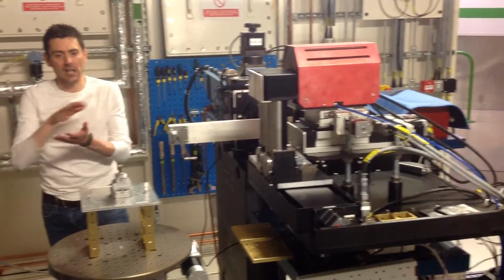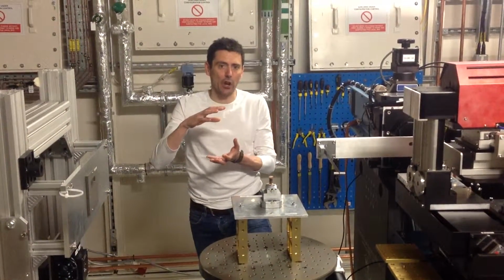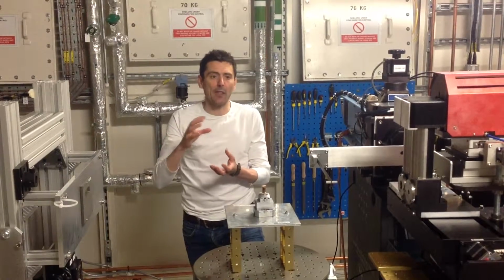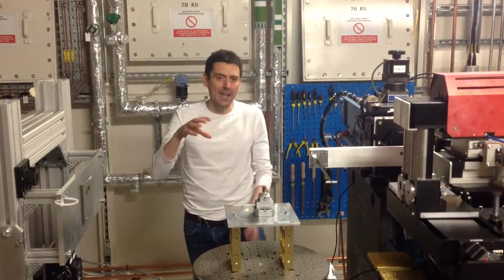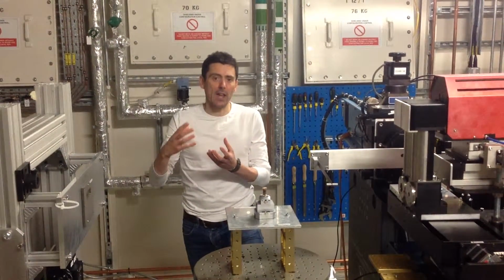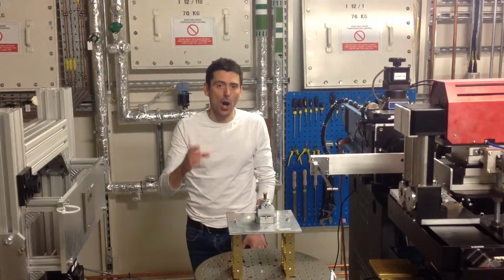And that essentially can take a 3D cross-sectional image, but maintaining a full 3D section of the sample, which we can reconstruct. And by doing that, we can start to understand the distribution of the minerals, the pore space, and the organic carbon. And that's important because we're trying to understand where the carbon is in that 3D structure of the sample. And that is important because we need to understand whether bacteria in the soil can access that carbon, which might be released back to the atmosphere. So we can start to understand processes within the carbon cycle.